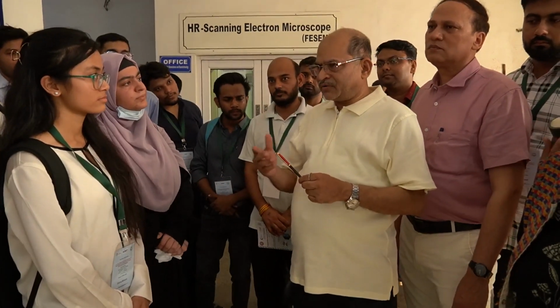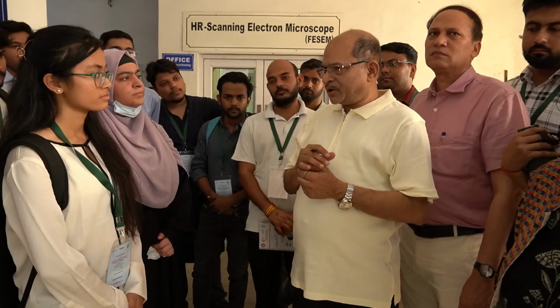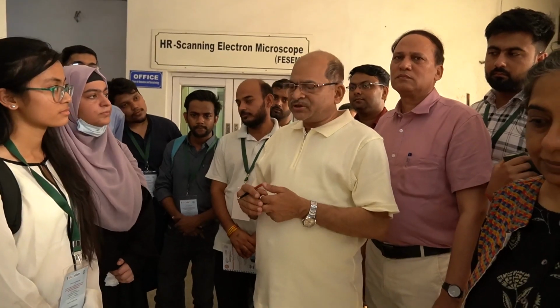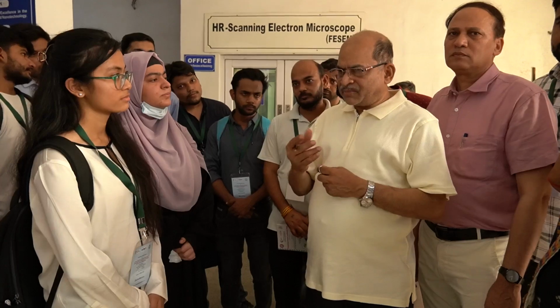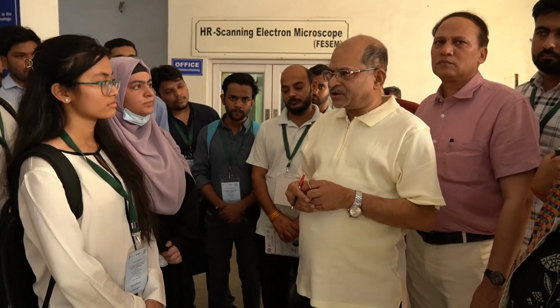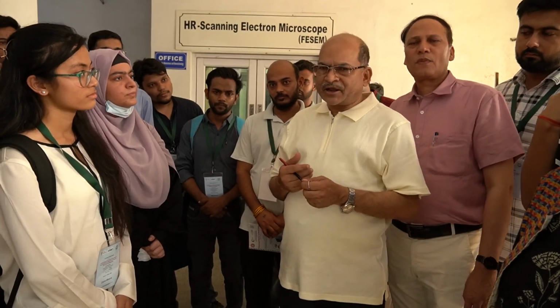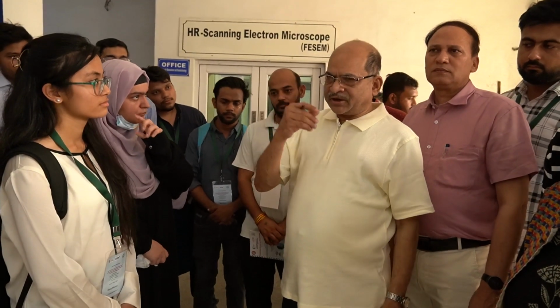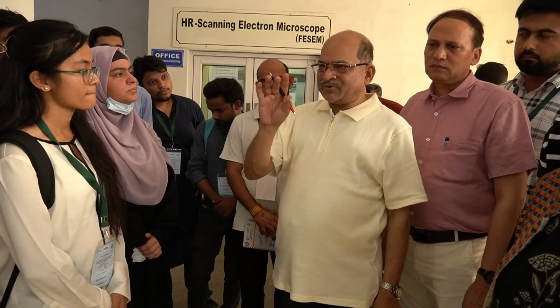RF sputtering multi-target for the heterostructure calculation, and also some basic equipment related to nanotechnology. So we have to use this for making different nanomaterials and for the sensing applications. Sensing lab is also there for this. So we can make different types of sensing. You have to visit and see the equipment, but still there is no functioning.